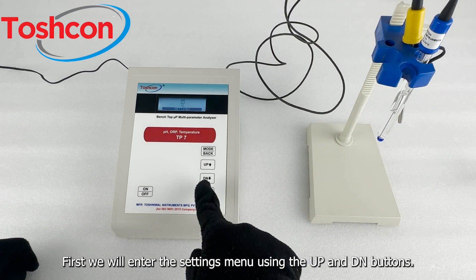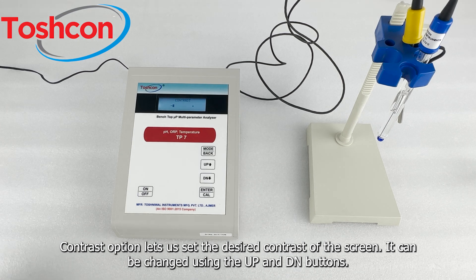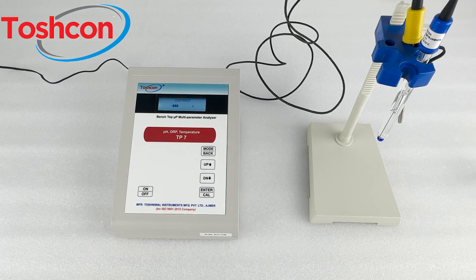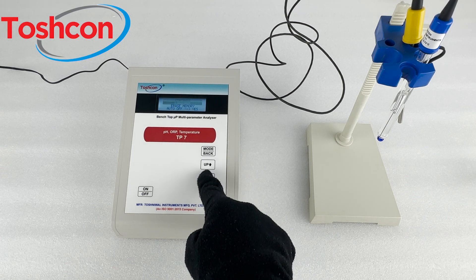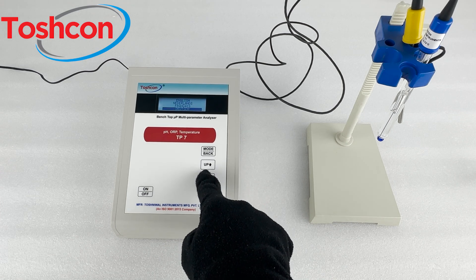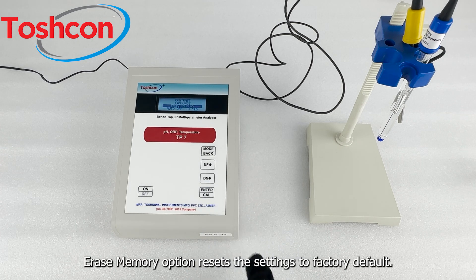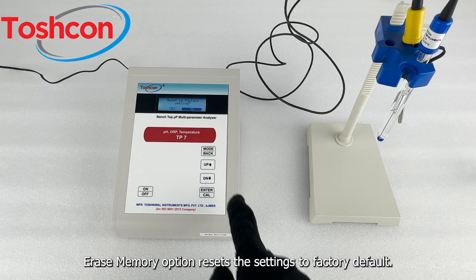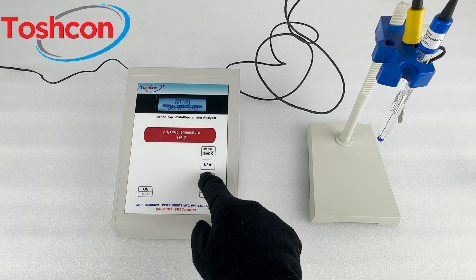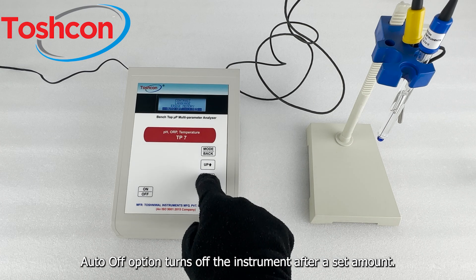First we will enter the settings menu using the up and down buttons. The contrast option lets us set the desired contrast of the screen; it can be changed using the up and down buttons. The language option lets us change the language of the instrument. The erase memory option resets the settings to factory default. The auto-off option turns off the instrument after a set amount.